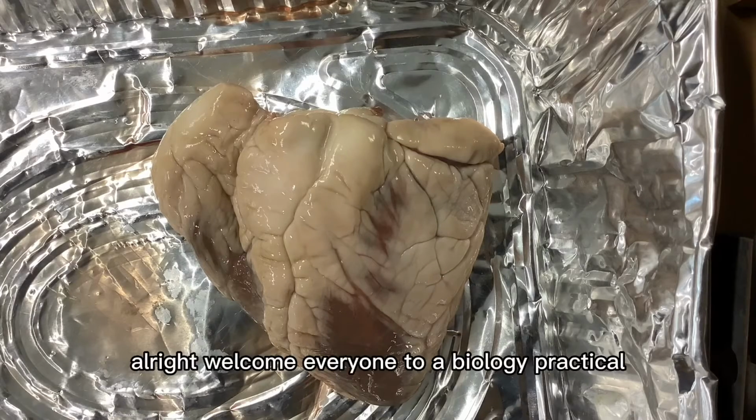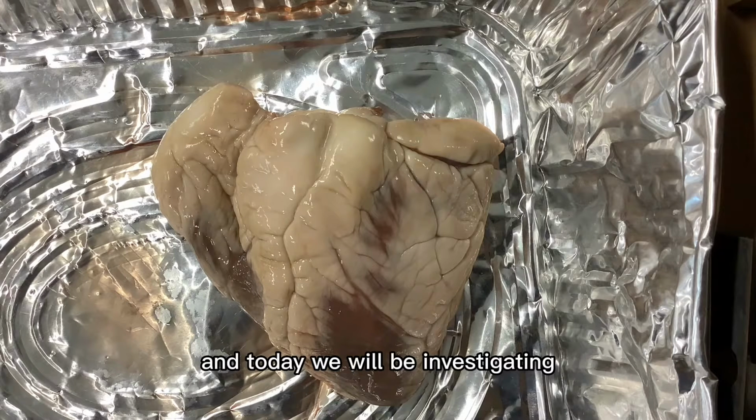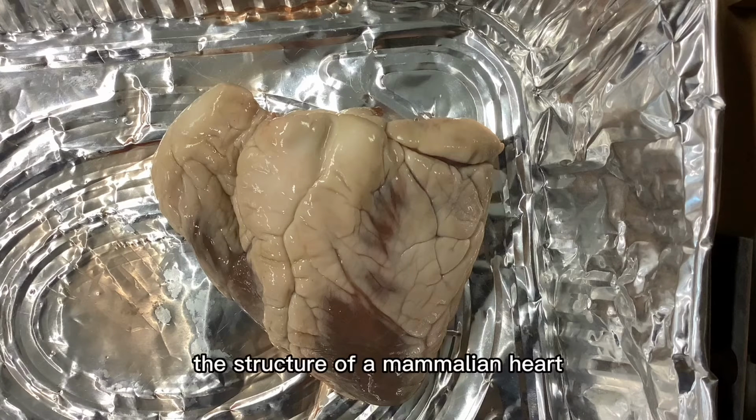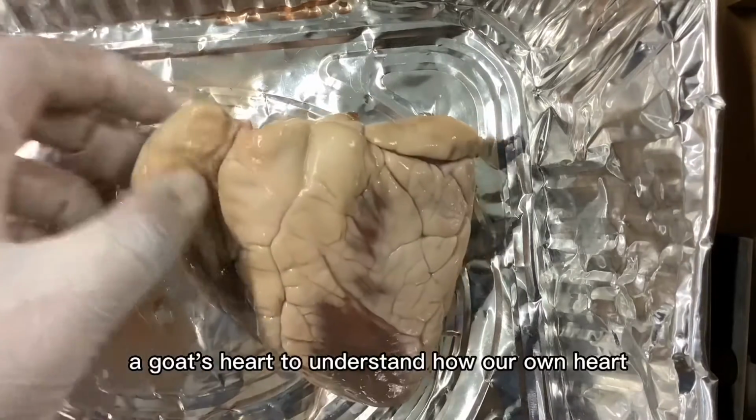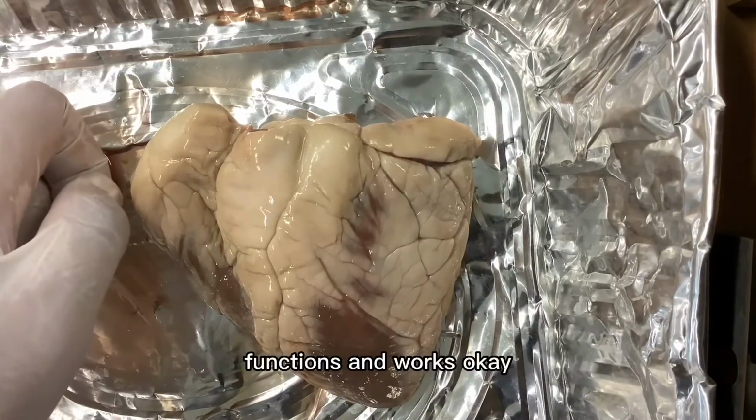Alright, welcome everyone to a biology practical, and today we will be investigating the structure of a mammalian heart. We will be using a goat's heart to understand how our own heart functions and works.